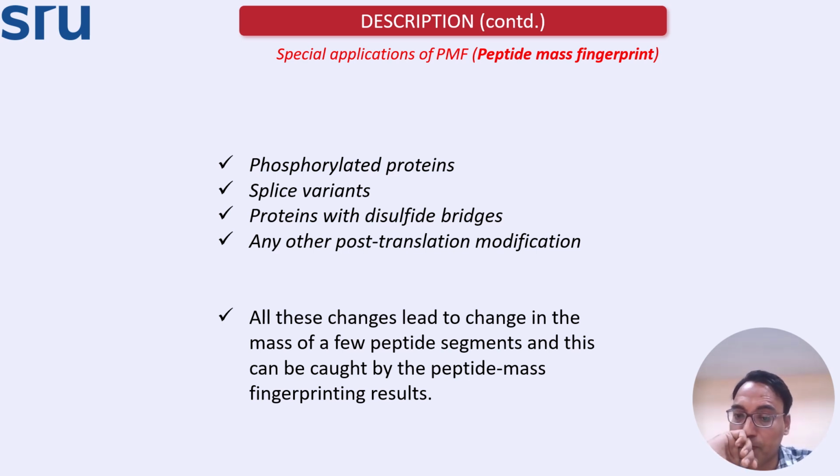So it is termed as peptide mass fingerprint. It's like the human fingerprints, very conserved, just like the protein or the peptide mass fingerprinting.